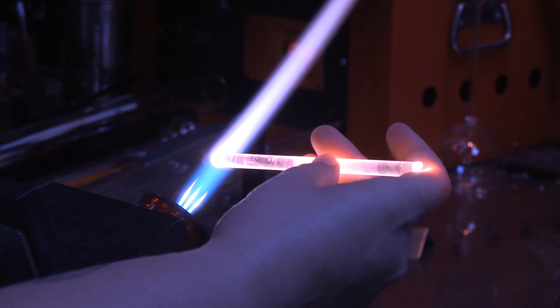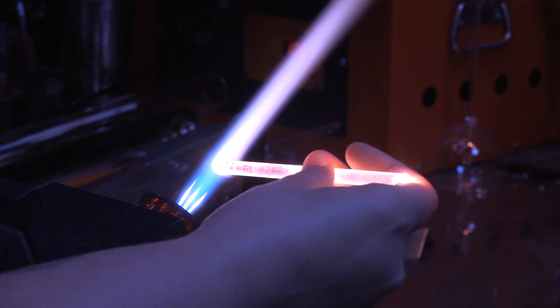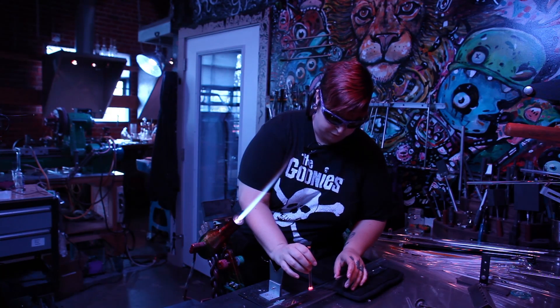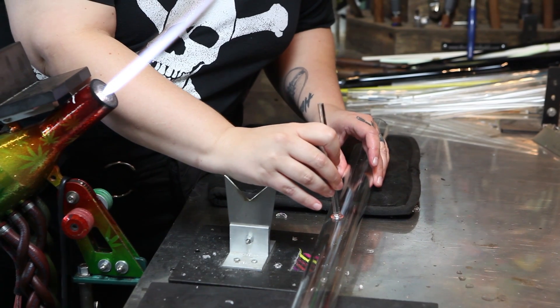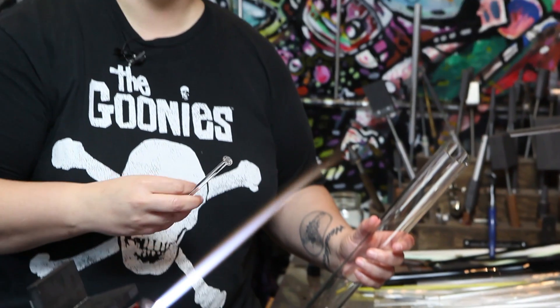When you see just the tip of it glowing super white hot, you're going to take it out of the flame and put it directly onto the end of your score mark in the water. It's going to cause your glass to crack, and it'll just go all the way around, and then you have two pieces.